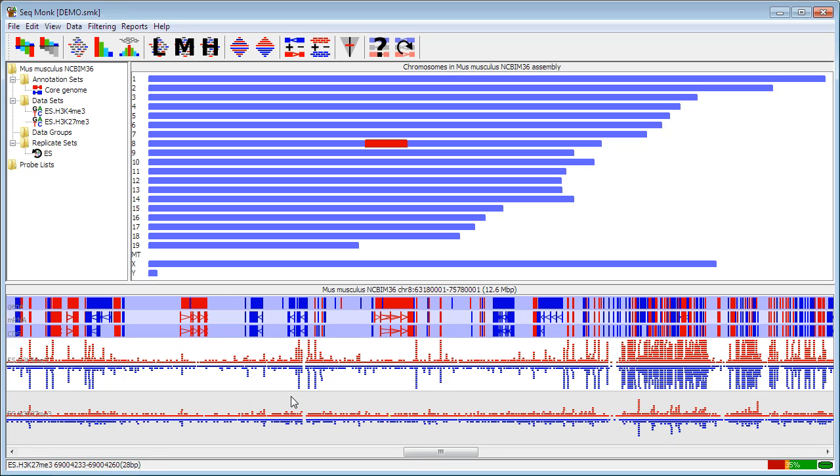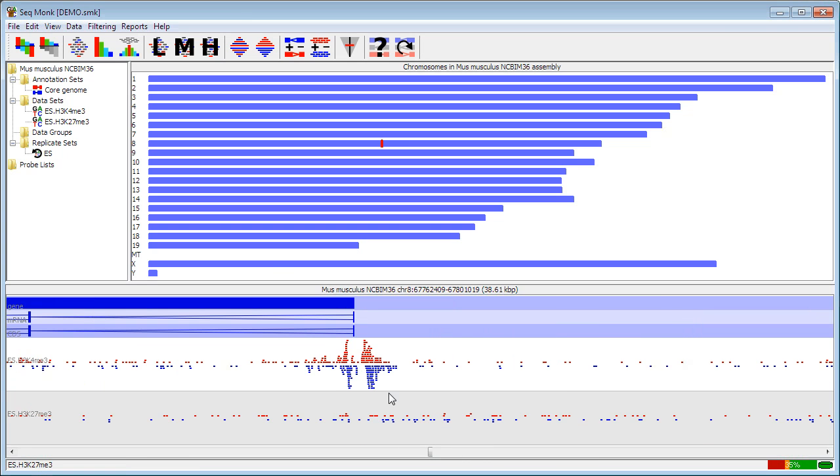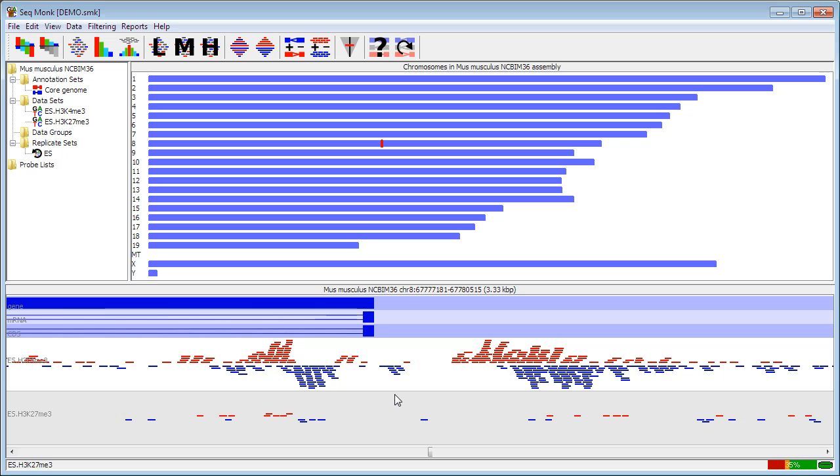Zooming in and out is fairly straightforward. To zoom in you simply drag a box within the chromosome view. You'll see a region highlights in green and when you let go of the mouse the highlighted region will expand to fill the whole view. So you can do this in an iterative way and jump in fairly quickly.